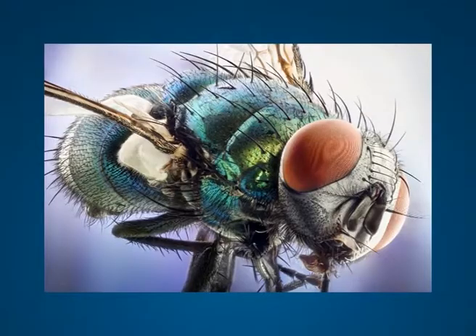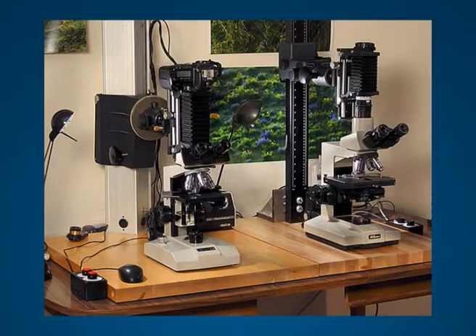Association of the microscope with light arrangements provides an invaluable contribution in different areas. Taking a photomicrograph is quite simple. Place a camera on a microscope with the proper attachment, lighten the object, duly focus the object and click.